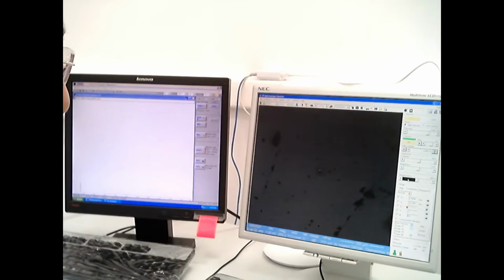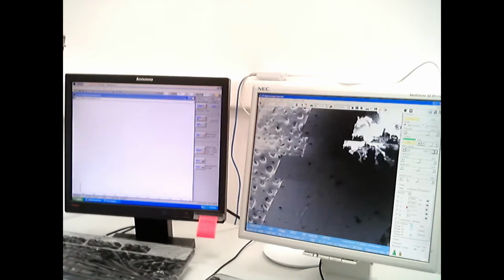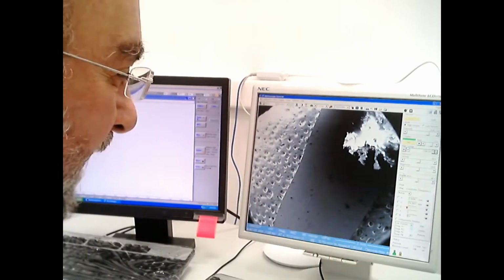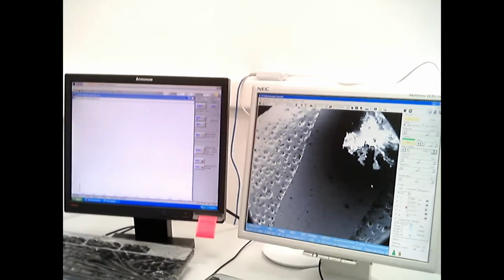You can get some information, and you can analyze a lot of these particles, and they are necessary. So we can find out if this blood is human or not human. Unfortunately, we don't have a lot of time today, but if you're interested in this sort of thing, you can write to me, and I'll tell you how you do that.